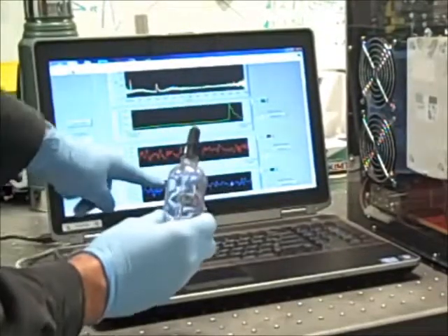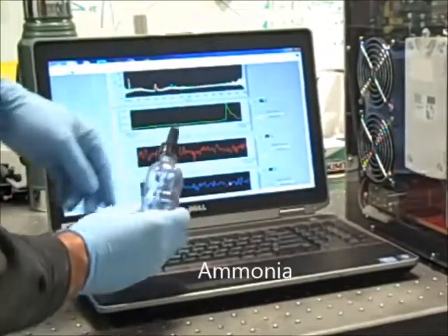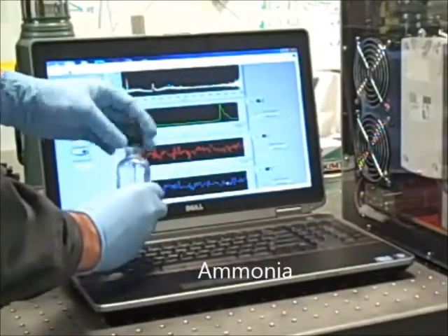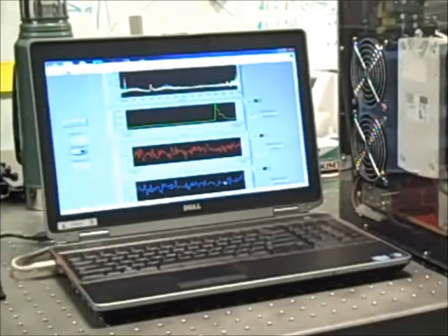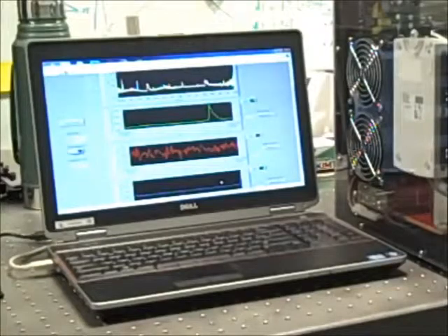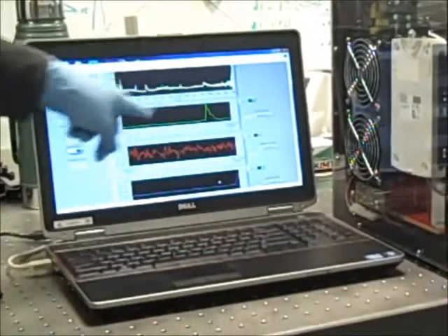Next, we have a bottle of ammonia, and the blue trace is displaying the real-time concentration of ammonia, which is currently at a relatively low level. Again, by cracking open the bottle, we release a small amount of vapor. Now the molecular fingerprint of ammonia is detected, and the measured concentration increases.